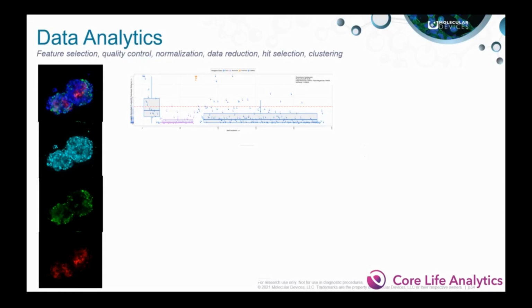principal component analysis, or over here I'm later representing the data points in a UMAP. Now all measured features are represented as a phenotypic distance score shown here. And so to sort of explain this a little bit, the positive control is phenotypically distant from the negative control. And so that's represented by the orange bars of positive control, and here are negative controls.